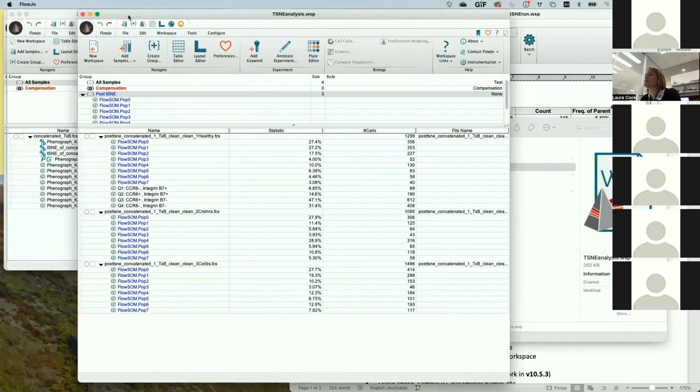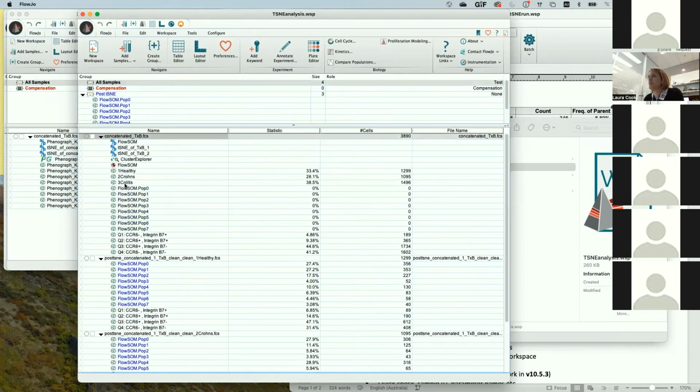I've got one simple question. Can you hear me? Yeah. Once you get the different populations that come out of PhenoGraph or these ones, you export them because you want to then be able to do things like batch analysis and get frequencies, applying essentially the same gating strategy, but getting the statistics out of each sample individually, no? Because you could also set up gates directly there, no?